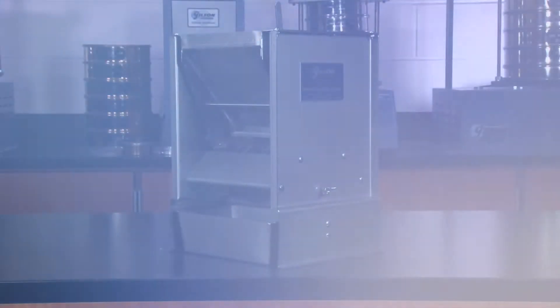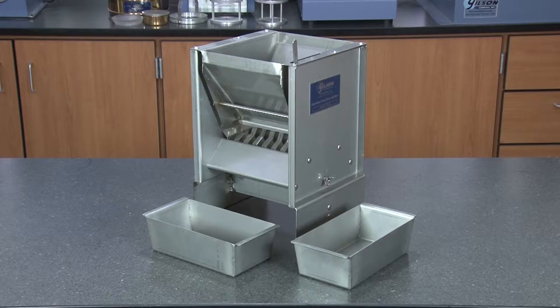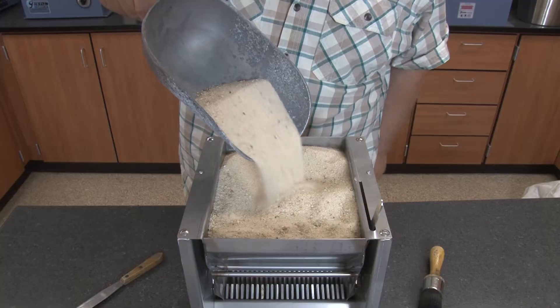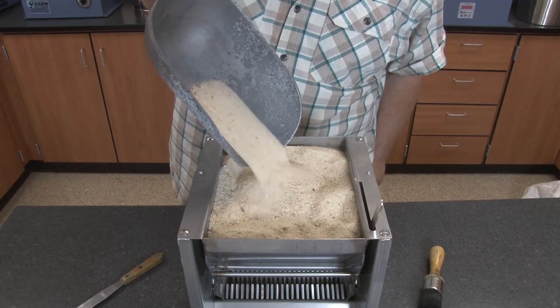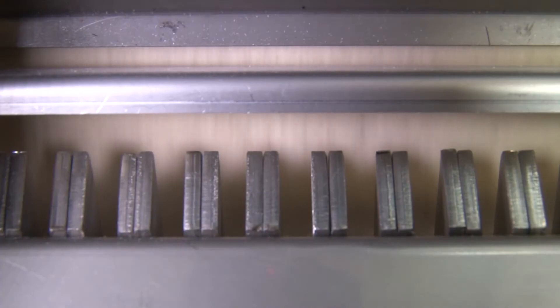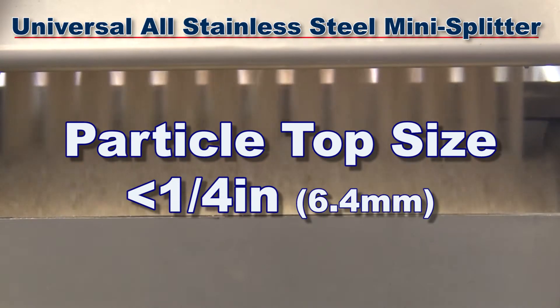The Gilson SB33 Universal All Stainless Steel Mini Splitter is one of Gilson's smallest sample dividers to feature the Gilson exclusive universal splitter design, making it a great choice for sample dividing powders, sensitive materials, fine aggregates, food grade samples, or abrasives with a top size less than a quarter inch.